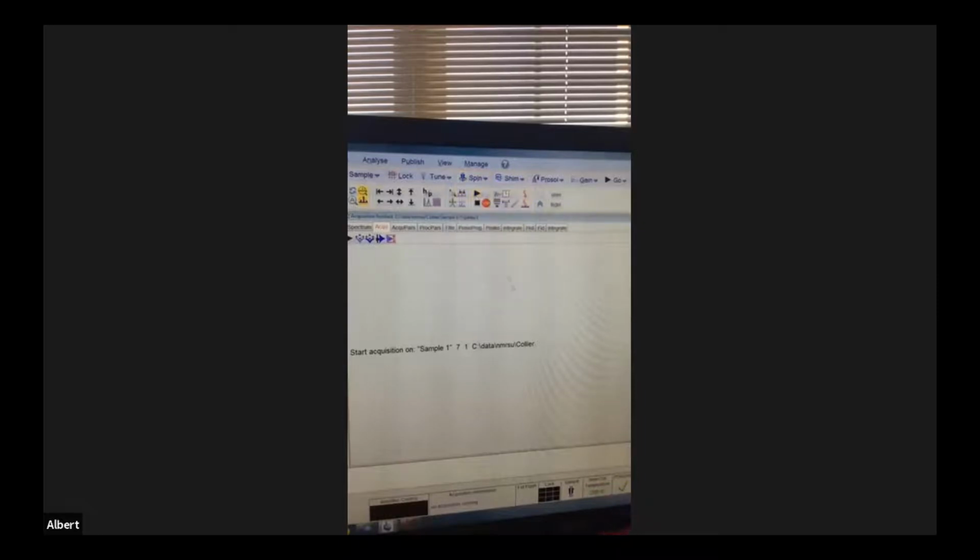Yes. And you'll see the red dot, the red arrow come around that spinner on the screen. So right in front of it. Now you can stand over my shoulder once again. I was trying to follow you. Now go to the next command, which is CHEM. Click. In that bottom left corner, that's where all your commands and all your functions are. Right there. This screen is all good.